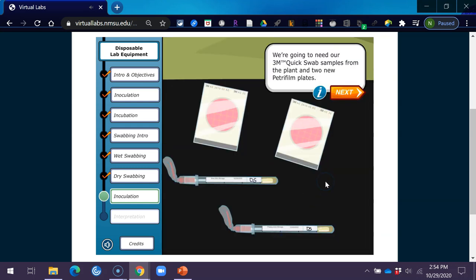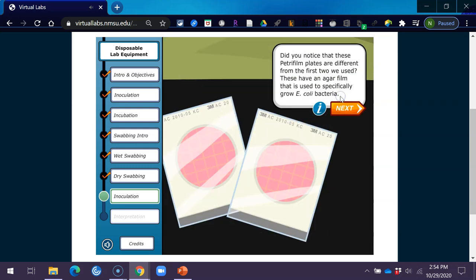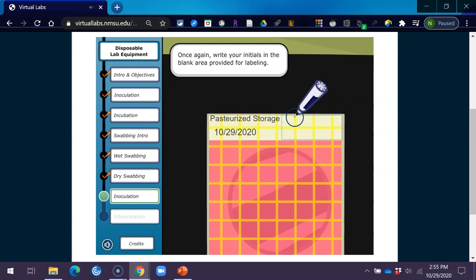We're going to need our 3M quick swab samples from the plant and two new Petri film plates. Samples must be kept properly stored until use, and analysis should begin ideally within 24 hours, and not later than 48 hours after original collection. These Petri film plates have an agar film used to specifically grow E. coli bacteria. Different bacteria require different nutrients to grow. Start by labeling the backside of your first Petri film plate with the date of the sample, where the sample is from, and your initials.